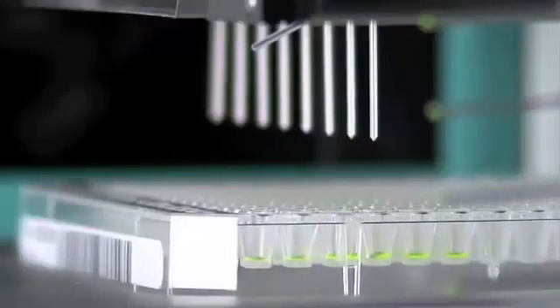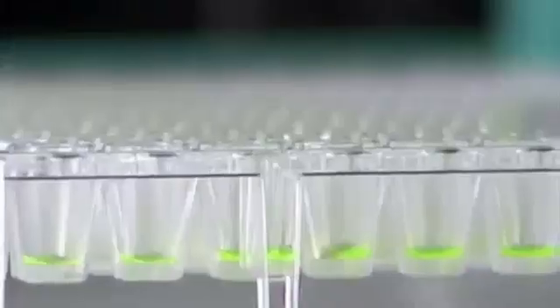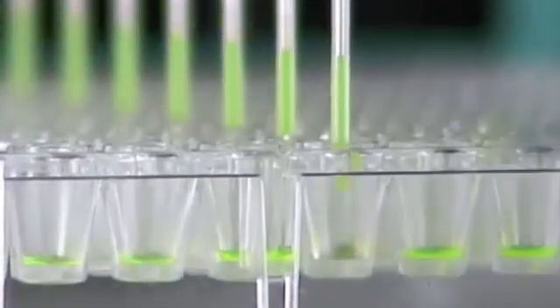This means that we can make on-the-fly dilutions or simply add media to assay plates after they have been created with Mosquito, without a robotic plate moving step in between. The benefits of Mosquito for assay miniaturisation are that it has a really low dead volume in the source plate, as well as negligible hold-up volume in the tip, so sample use is really optimised.